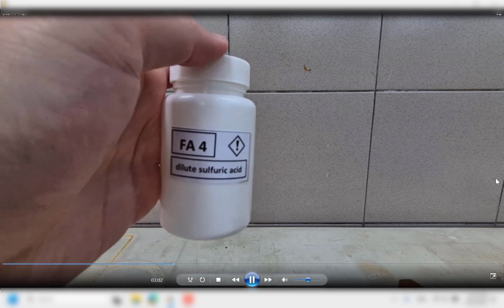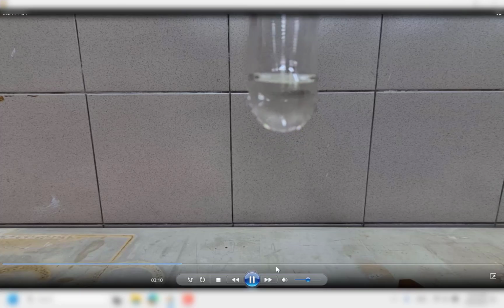I think earlier on, I showed you the filtrates. Maybe I should go back a bit. So this is the filtrates, colorless in color. Then I'm going to add in dilute sulfuric acid. That is the second row of page 3. This is a bit hard to observe. So if you're in doubt, you might want to take a look at the earlier video being produced, on practical 14 or 15, I can't exactly remember.